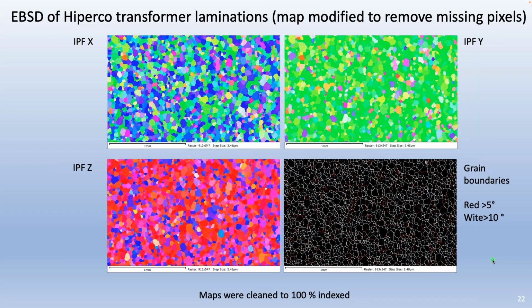If you're talking about noise reduction in an actual map, well, again, if you see things in your map that are not physically realistic after you've done your noise reduction or your cleanup, then I'd start to go back and think about, what am I doing here? What are my final goals? When is too much cleanup too much? So that would be sort of the answers I'd have to those questions.